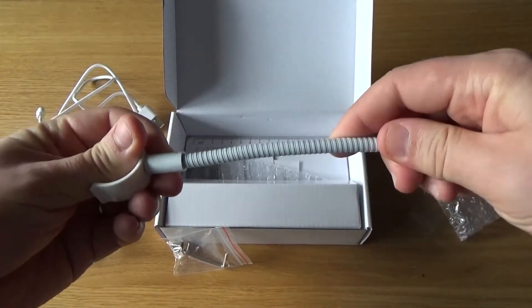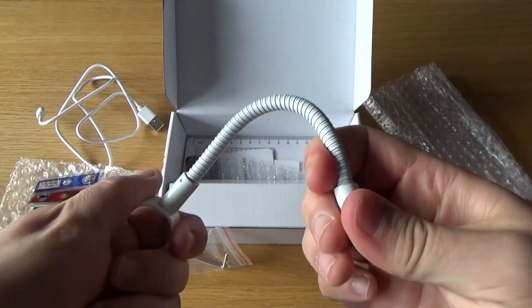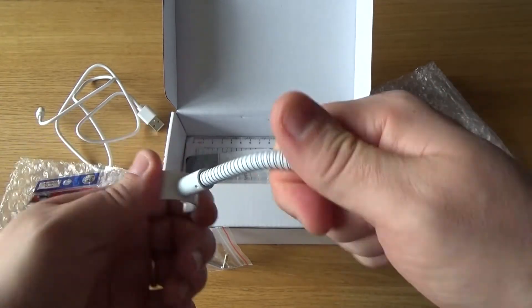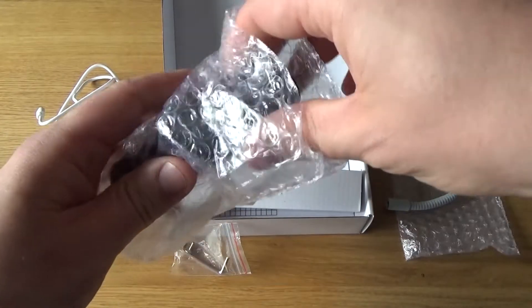This is the little arm that holds the microscope in place. It bends and it's fairly solid — you could probably put more weight on it than the microscope itself. It holds it in place rather well.